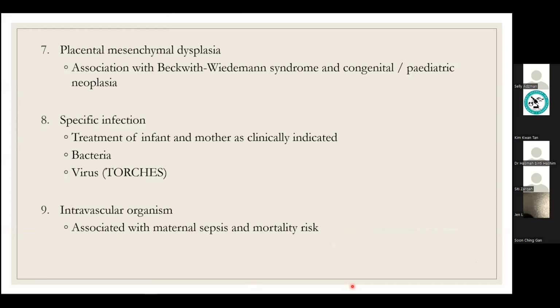Okay, again, we'll repeat: placental mesenchymal dysplasia, which is missed during grossing. Probably you have it just histologically, probably not so prominent as grossly, but you can see it in the light microscopy.